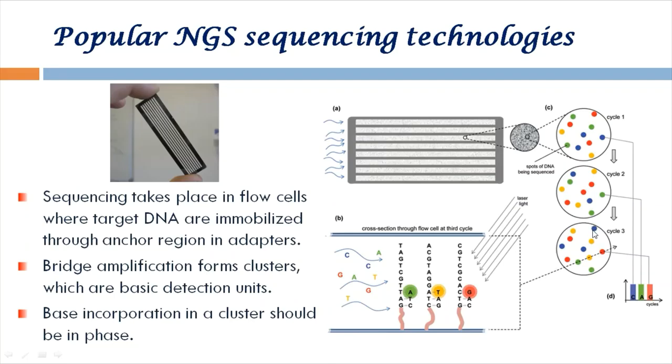And what is more important is you have to look at the size and scale of this experiment. You see, it's so tiny. Within that, some other environment, and within this, you have about 10 different fragments, not the same fragments. So the sequencing is done on such a massive scale. That is what I want to underline here, right? So after all these things, the sequence can be interpreted, and then you have a set of reads and the corresponding sequences.